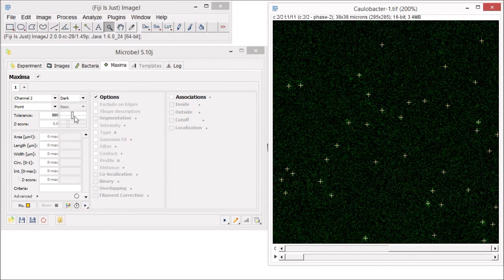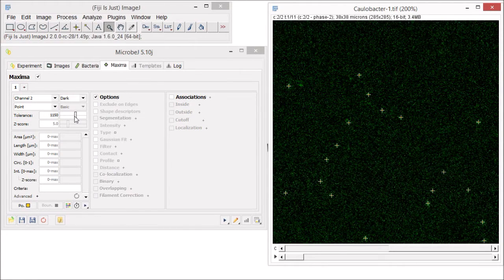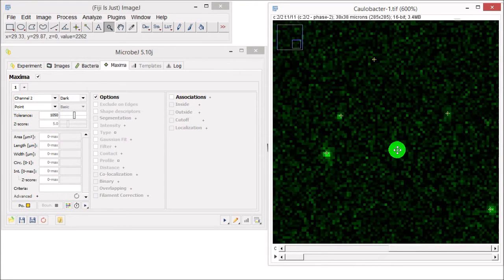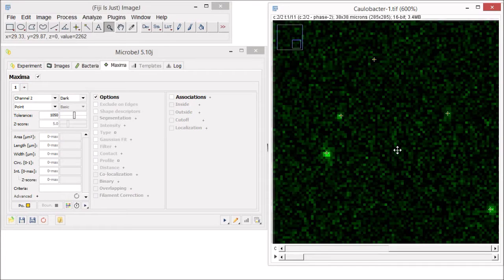You can see that decreasing the slider includes a lot of surrounding background noise, while increasing the slider reduces the number of maxima detected. The point mode is the fastest, but also the most basic way to detect maxima in our image. In fact, because the maxima detected are single XY coordinates, there is a very limited number of attributes we can actually measure and use to filter out unwanted maxima.